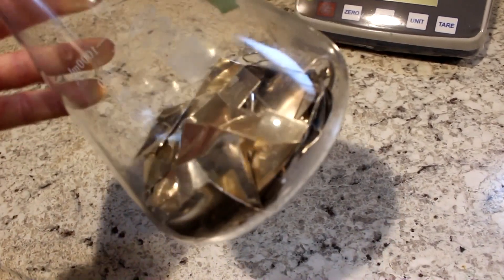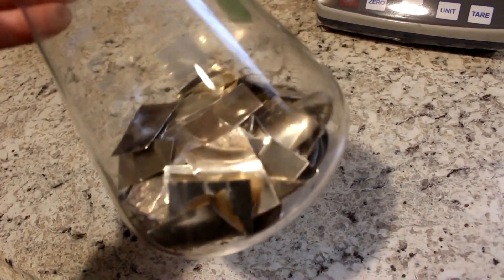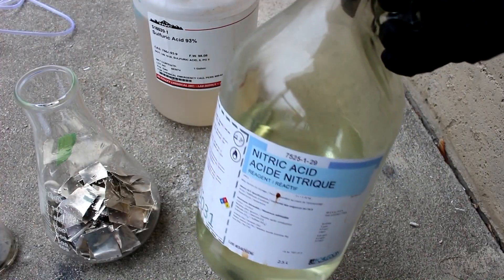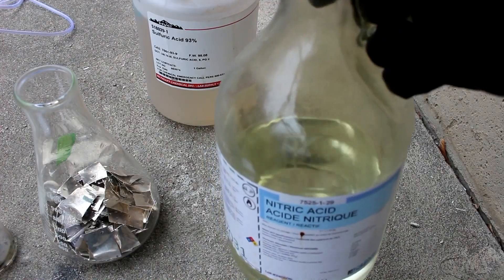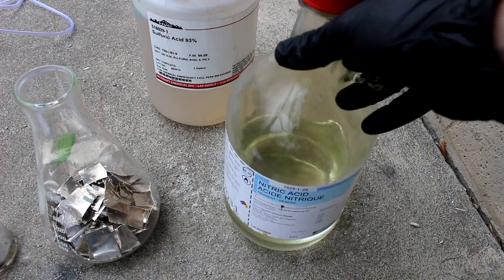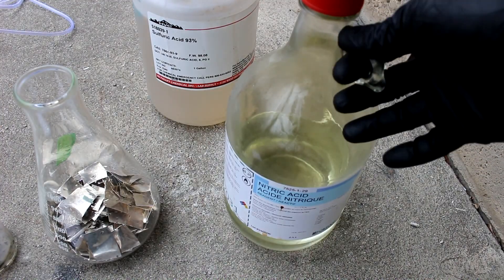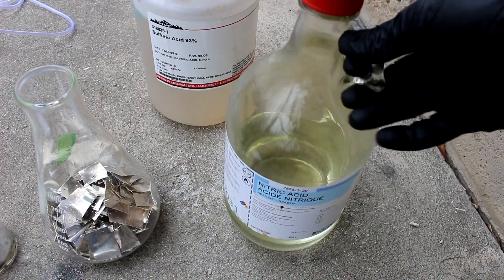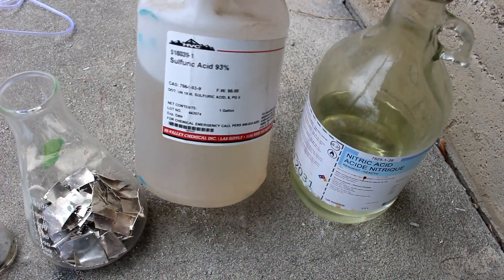That was painful to do because the silverware is probably worth more than the melt value of the silver. But the deed's done — may as well turn it into a nice pure silver bar. The easiest way would be to dissolve it in nitric acid, but doing the math I'd need about 800 milliliters, which gave me sticker shock. So I decided to use a different method — I'm still going to use nitric, but supplement it with sulfuric acid. Sulfuric acid alone will dissolve silver, but it's incredibly slow and needs to be quite hot.